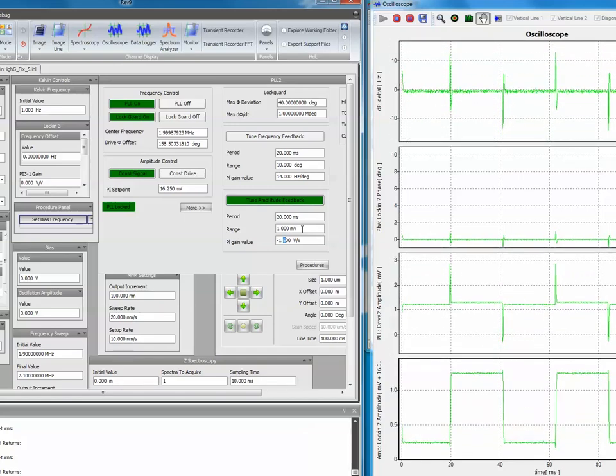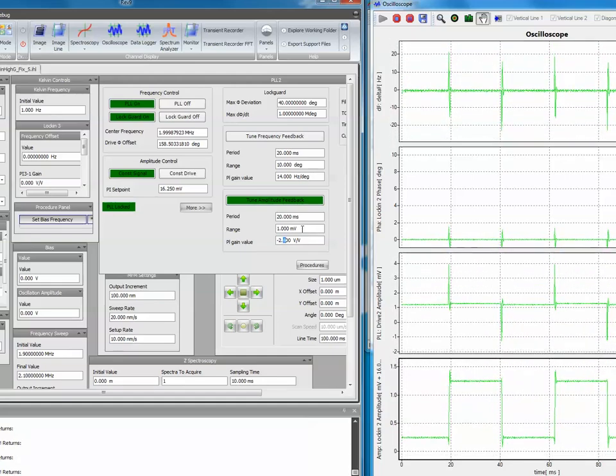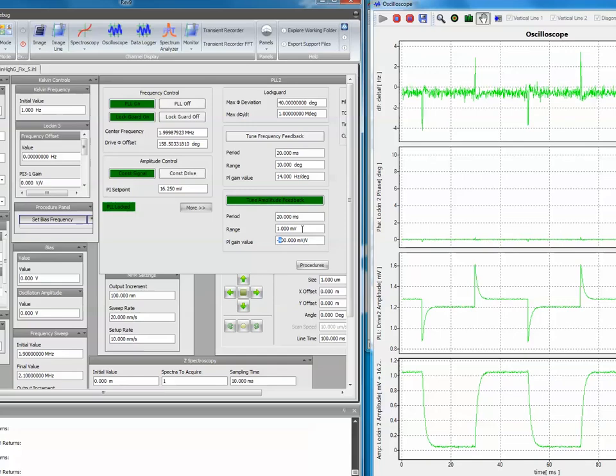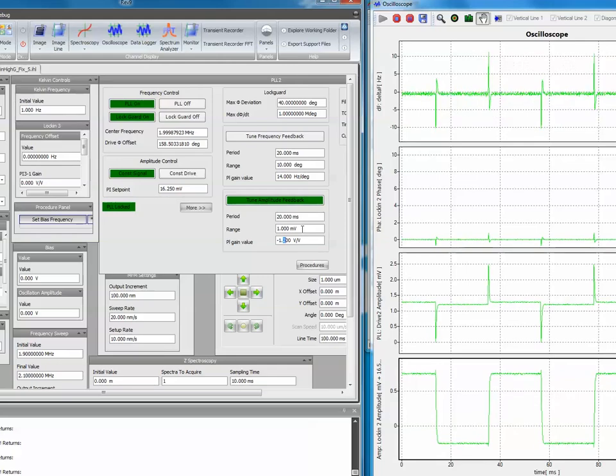You should tune the amplitude control to about the same rise and fall time as you did with the frequency control. So this is at 1.5. This is pretty good. Maybe 1.4. If you go too far, you see ringing again. That's here. If you go too low, you see the shark fin rounded edge again. So somewhere around 1.1, 1.2 should be the optimum value.